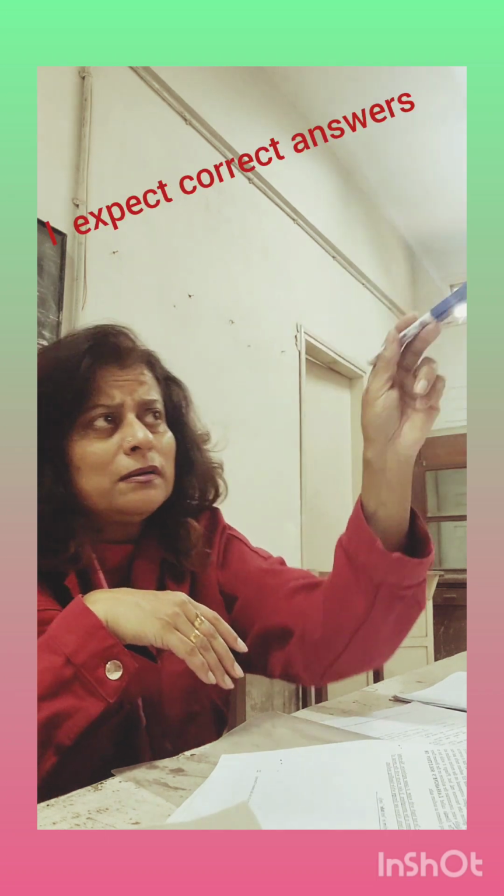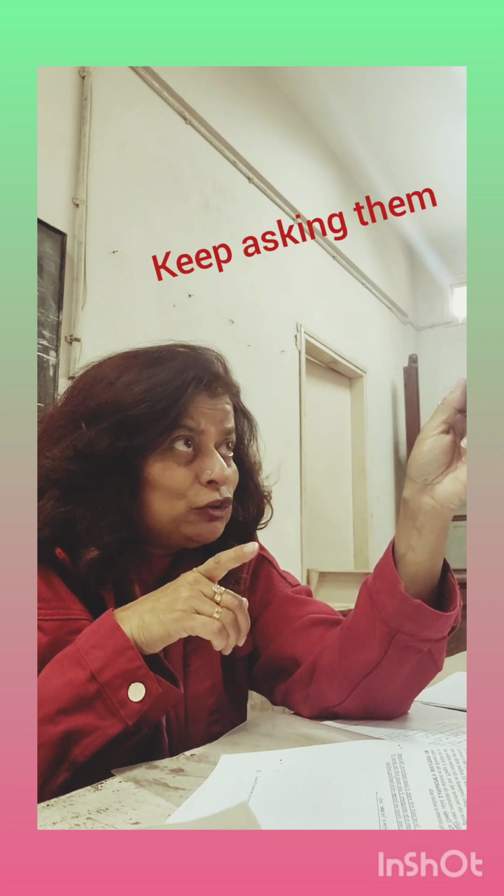So we know it has got nitrogen in it. Besides carbon and hydrogen, there is nitrogen in it. There is no sulfur. There are no halogens. So the test for nitrogen is supposed to be positive. The test for sulfur and halogen is supposed to be negative, whereas the test for nitrogen should be positive, as we know the name. It's acetanilide. You tell me, what is the name of the compound? It has got nitrogen or not? Does it have sulfur in it? Does it contain the halogens?